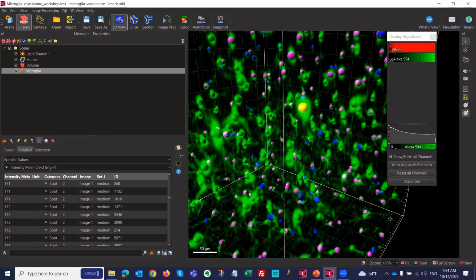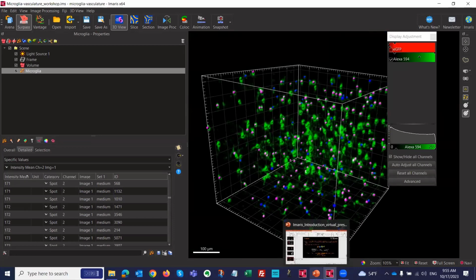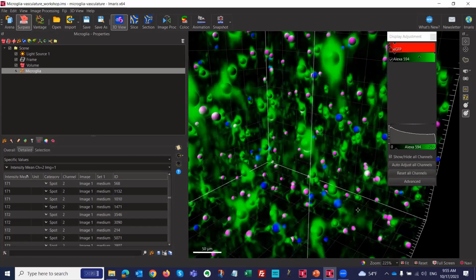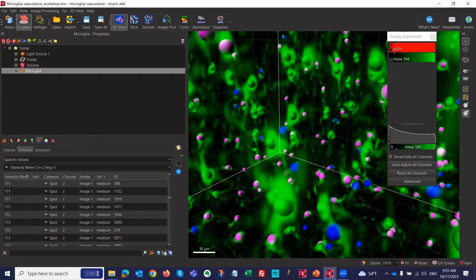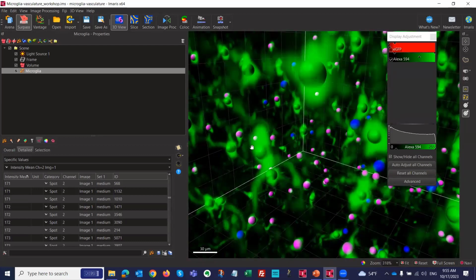So any questions? Yeah. Here, when you measure the intensity, spheres, they have a little figure like this. Does it count the intensity of the whole thing, or just what it counts as a sphere? Yep. Good question. So the question from the audience is, we have the microglia, they have the processes and extensions in here. They're not obviously perfect spheres, but if we have the sphere here and we look at the intensity, what intensity is measured actually?